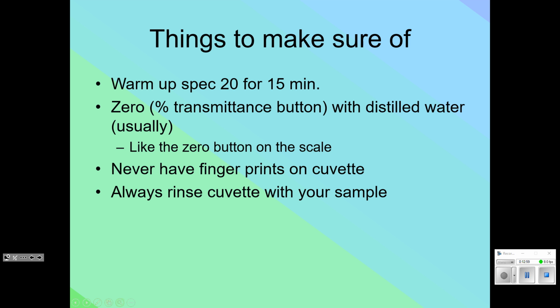So what we suggest doing, which seems a little wasteful at times, and I get it, is you rinse this with what you're going to put into it. So when you get started at the lab today, it looks like I have to put some plastic pipettes out for you. But you're going to squirt some in here, rinse it around, then dump it out, then fill it up to about that white mark. Now it's ready to go. But if you don't do it that way, you're going to throw off your results.